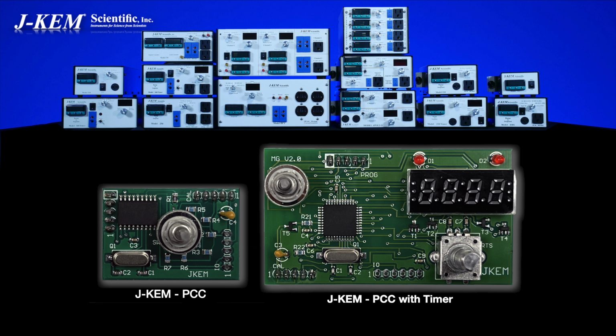And when the answer to that question is no, it turns the reaction off. When you look at the entire line of J-KEM temperature controllers, whether we're talking about our economy series, our research grade controllers, or our high safety or high power controllers, fundamentally, they all share the most intelligent PID temperature controller on the market. Then, starting with that foundation of the PID controller, we add other features.